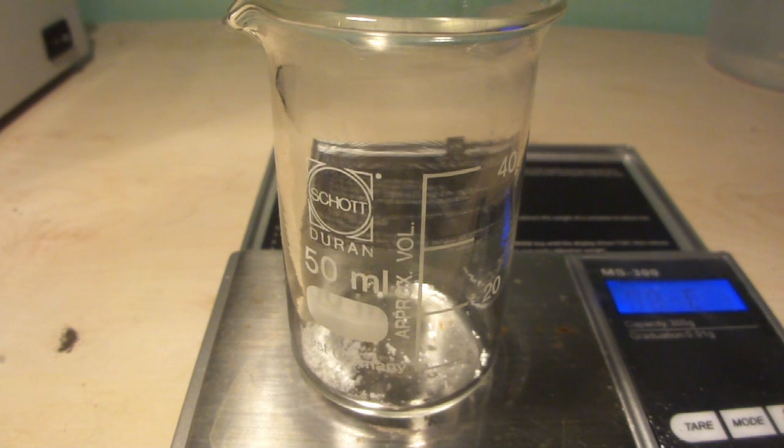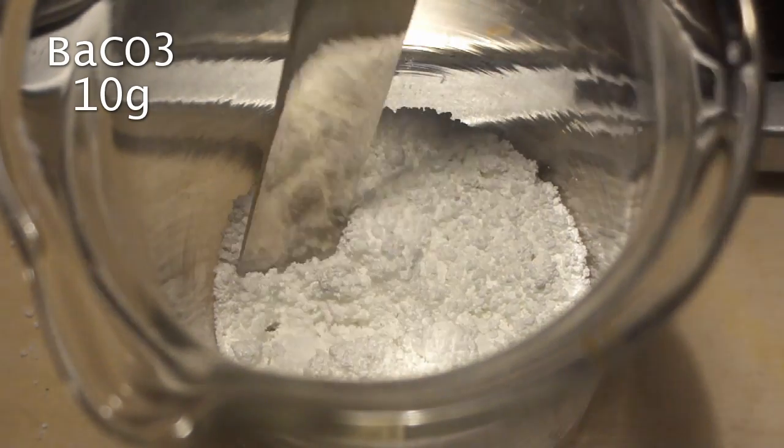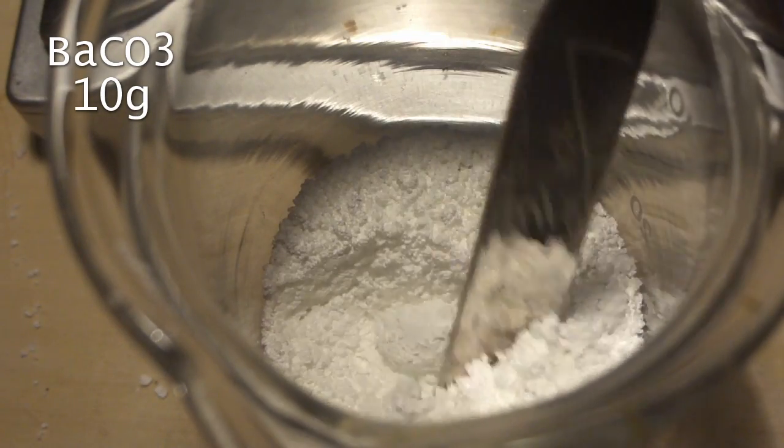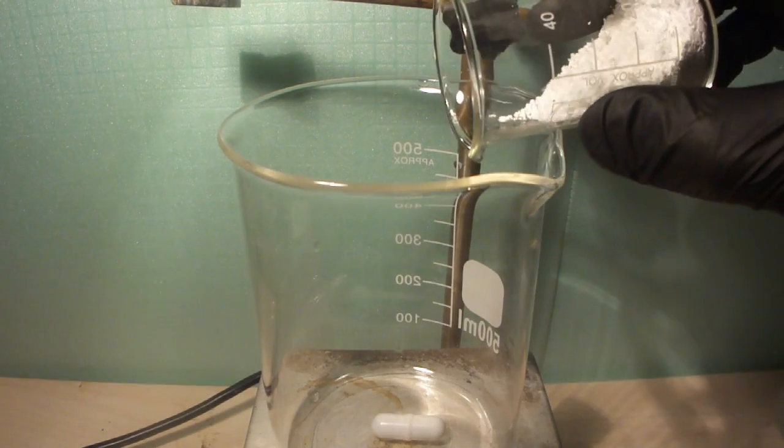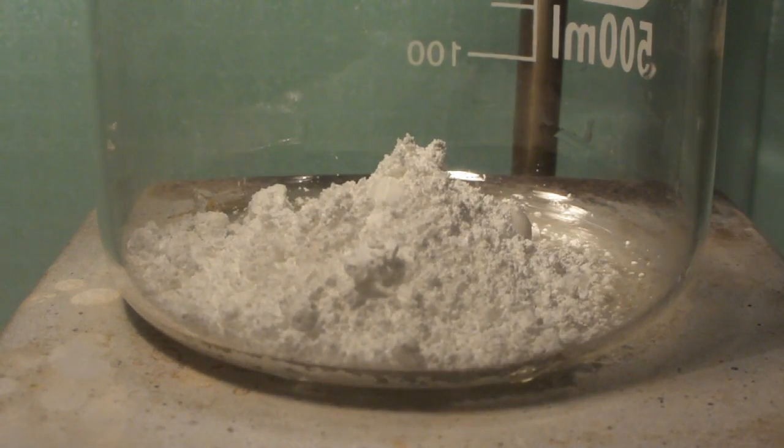Start by measuring out 10 grams of barium carbonate, as this is generally the most available barium salt. You can of course use other barium salts like barium oxide and hydroxide instead. Transfer the barium carbonate to a beaker equipped with a magnetic stirrer and add some water to form a dense slurry.